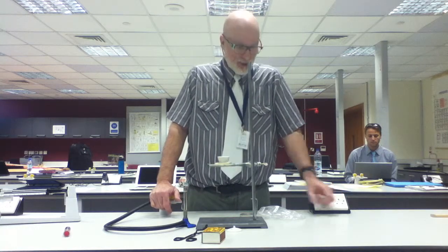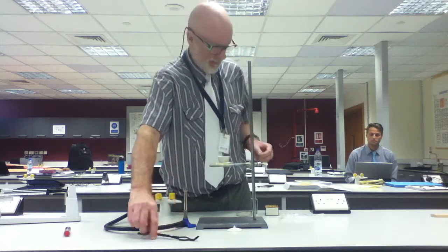Excellent. Okay, now, so we're going to take oxygen and magnesium and combine them. All right. Let me just burn a little magnesium metal. I just want to burn a little bit of it, just to show you the actual reaction that's happening. And what I'll do is, girls, thank you for listening. And what I'll do is, I will show you what this looks like. Okay? All right.